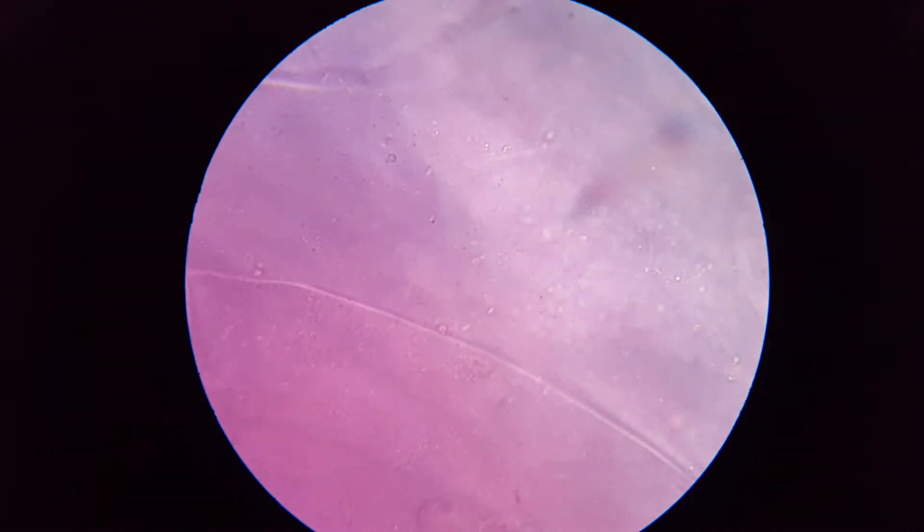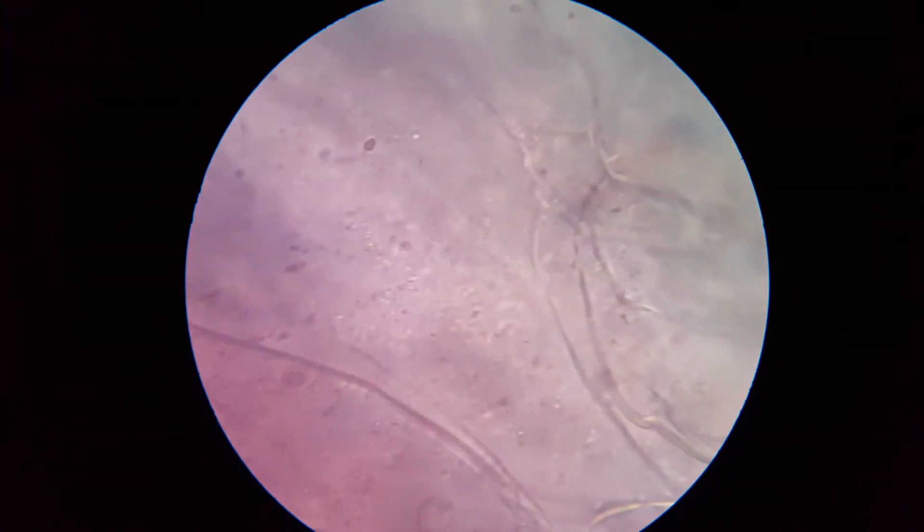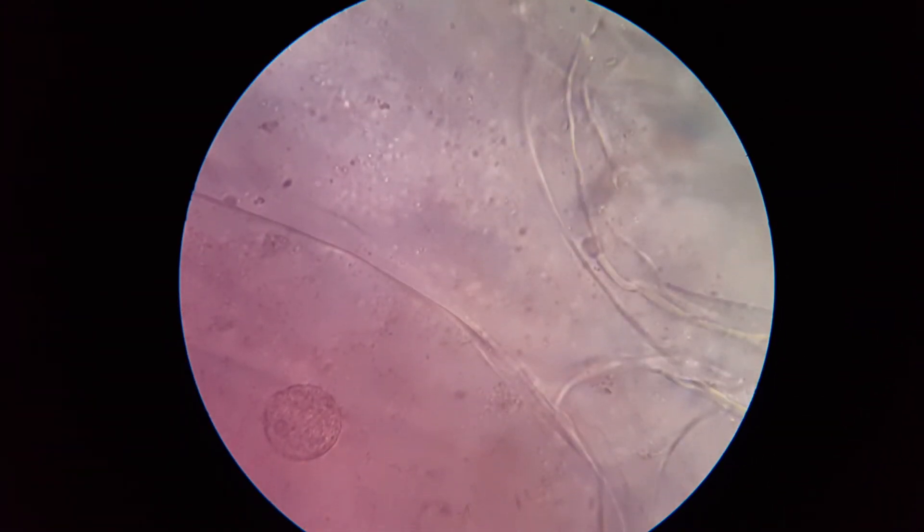Flipping that into place. So that's a thousand-fold magnification. Let's see if we can see a nucleus again.